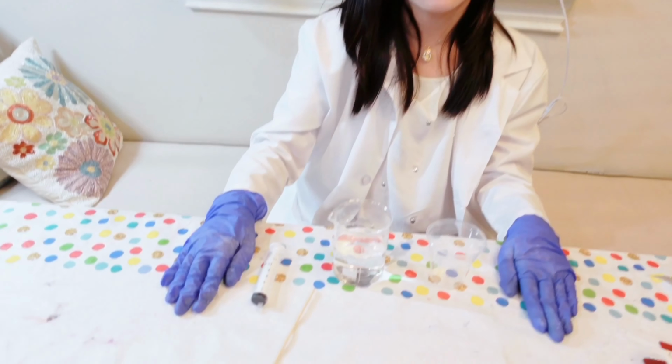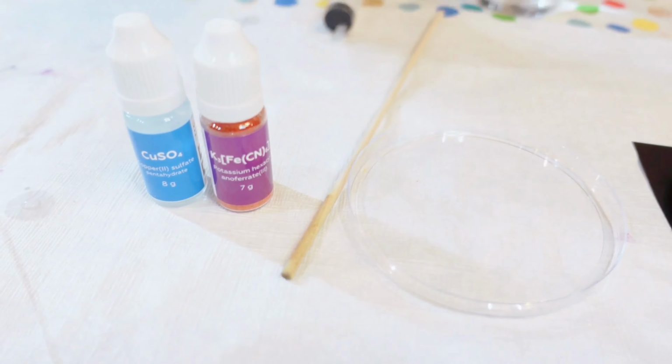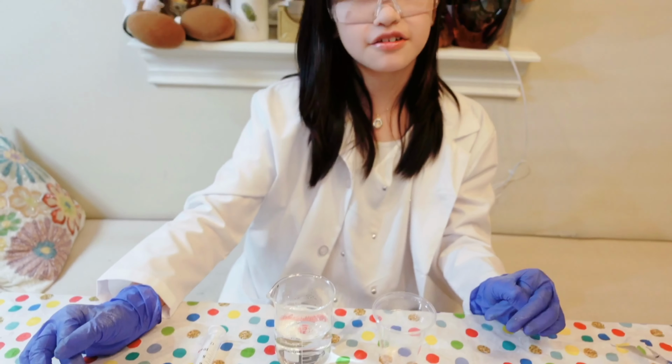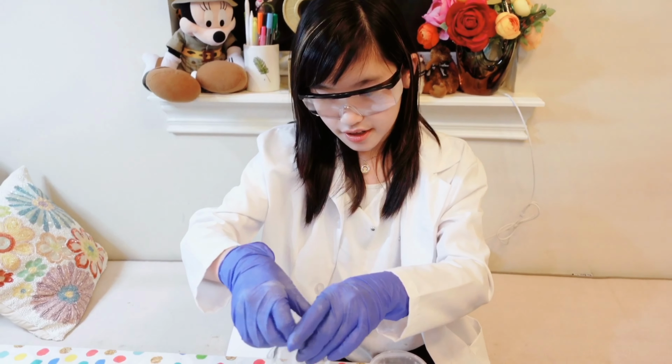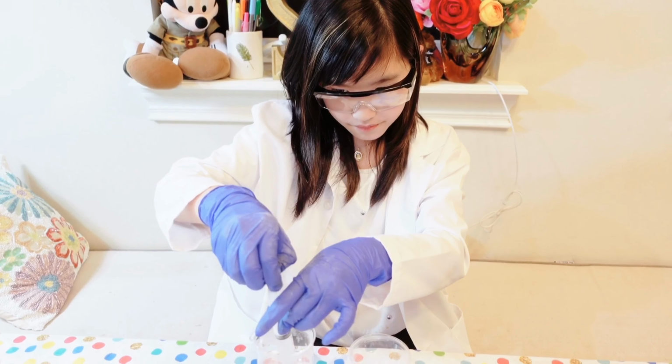Okay, so we're going to do the same experiment, but with blood. To make it blood red, we're going to use potassium hexacyanoferrate. So it's going to make it blood red. We're going to do the exact same steps, and I can do it with you. So first you want to get 20 ml.